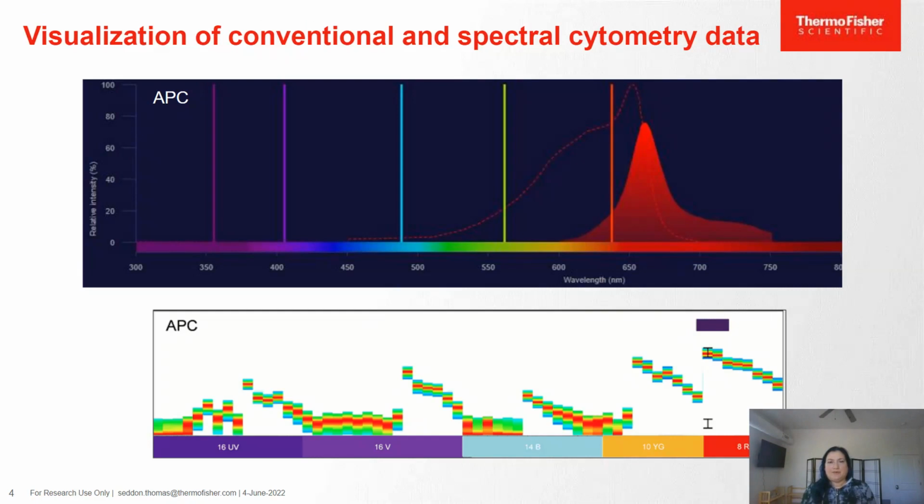Sometimes what spectral cytometry does is really show us what is happening even on a conventional instrument. If you've used a number of dyes and start to notice, hey, this is affecting some of the other detectors, spectral cytometry is showing us, hey, this is actually predicted based on this dye. And so we can really see what's happening in your overall panel. This is happening whether you're using a conventional or a spectral instrument. This is just showing you, again, what we would think of as the off-target emission spots in terms of that cross-excitation.